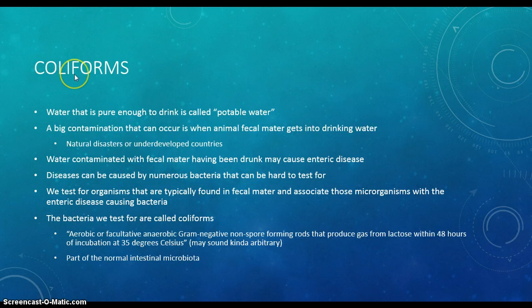So the first thing you've got to see is, what is a coliform? Water that is pure enough to drink is called potable water. If you're following along in the lab manual, I'm pretty much using that as the main source here. I'm on page 81. But yes, potable water is water that is good enough to drink.